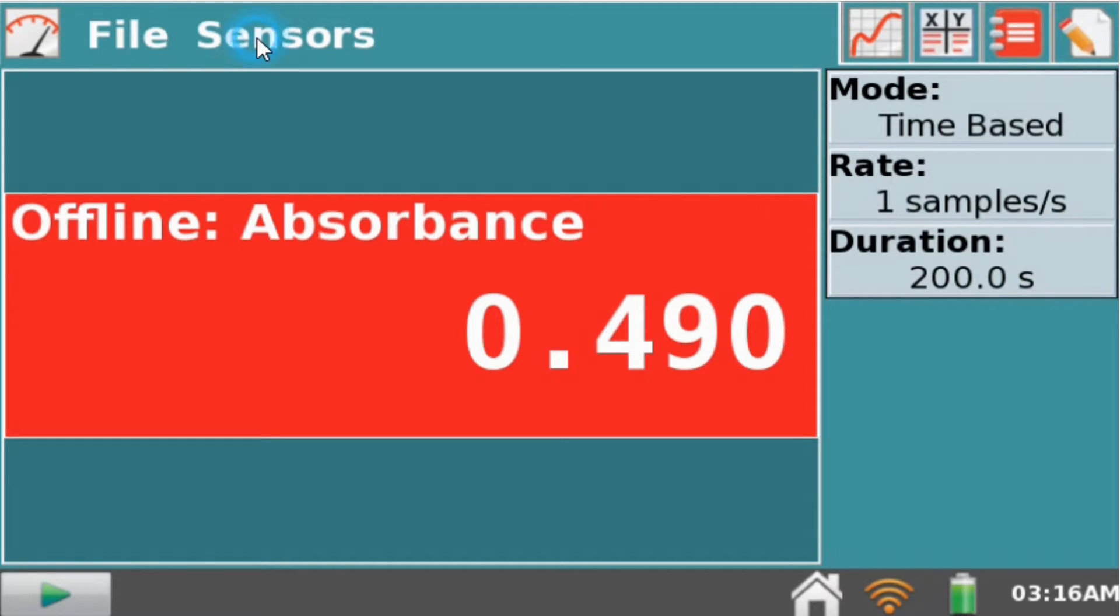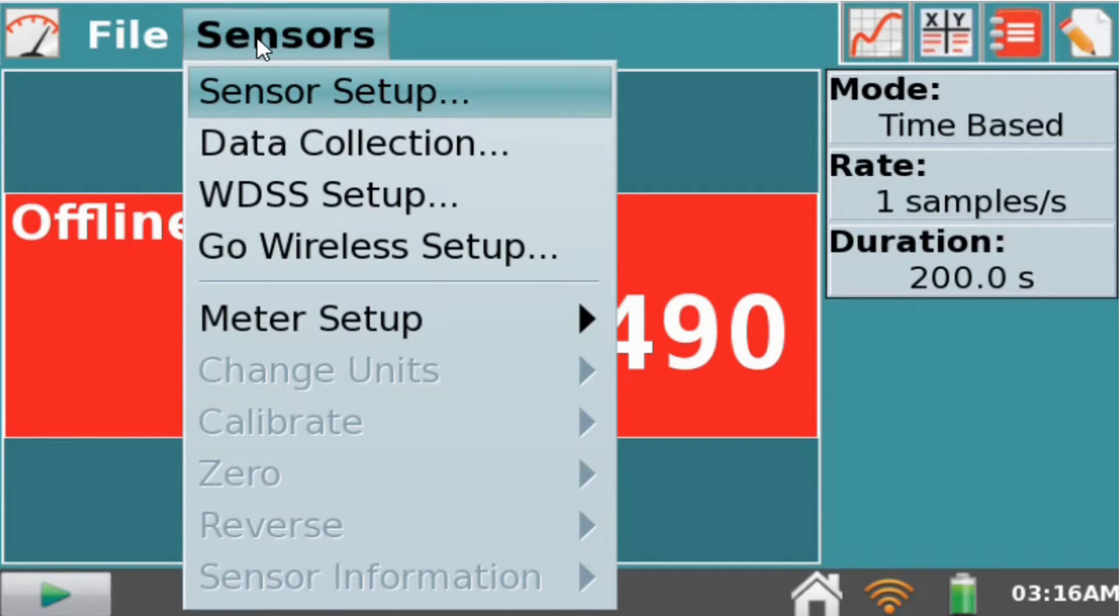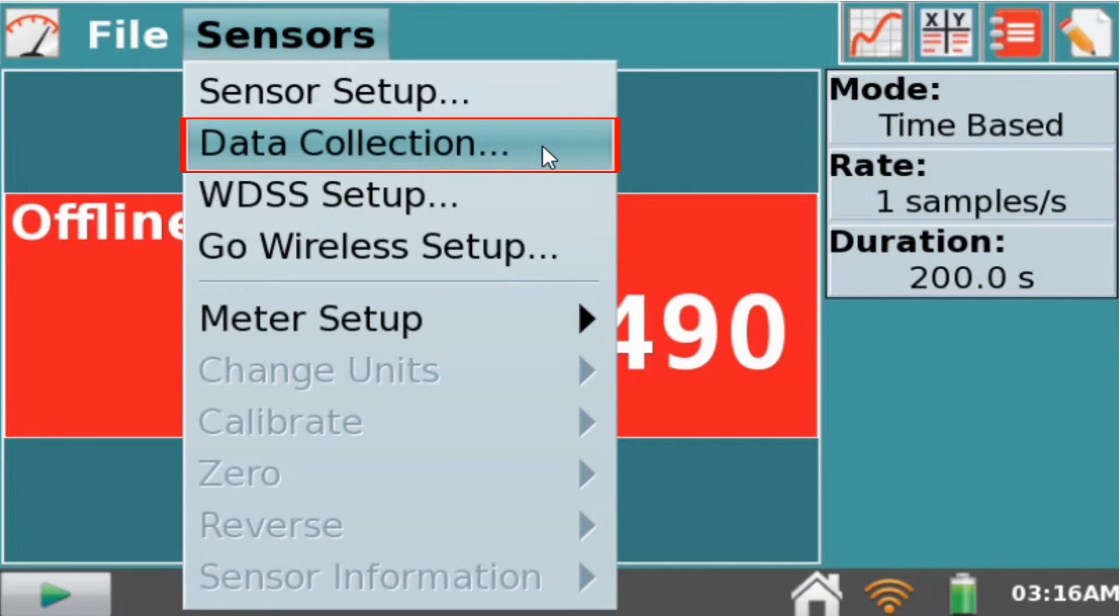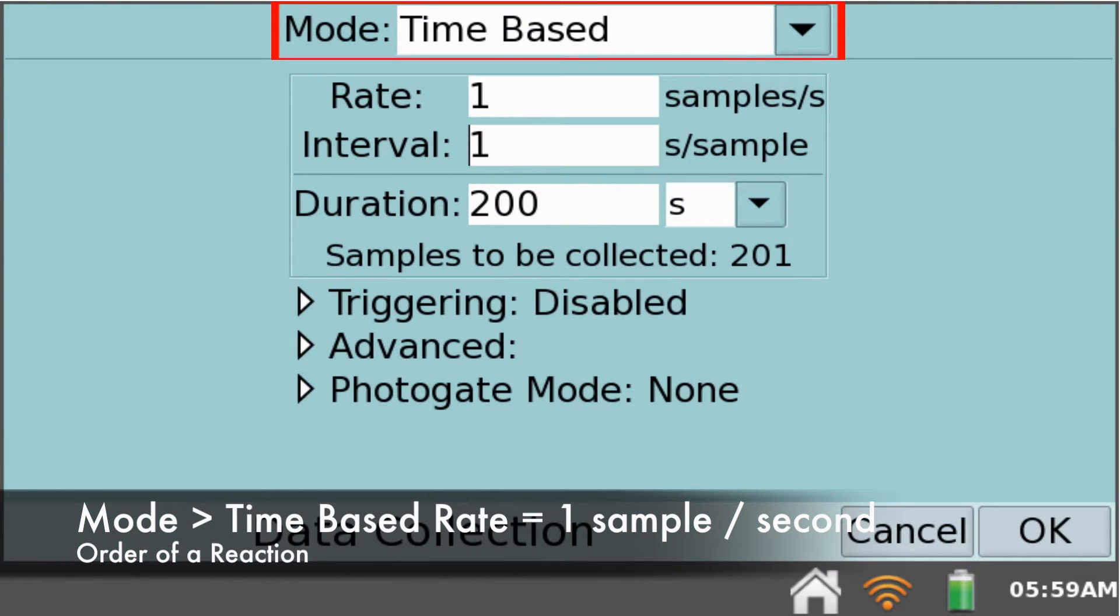Setting up the sensor, in this case the colorimeter. Select sensor, data collection. Choose mode to be time based.